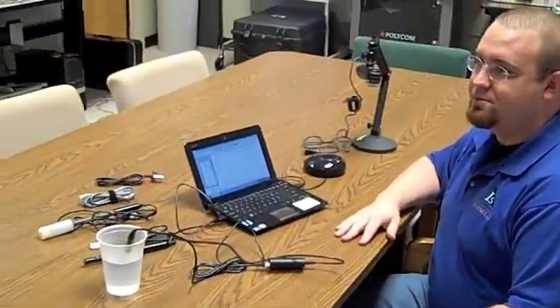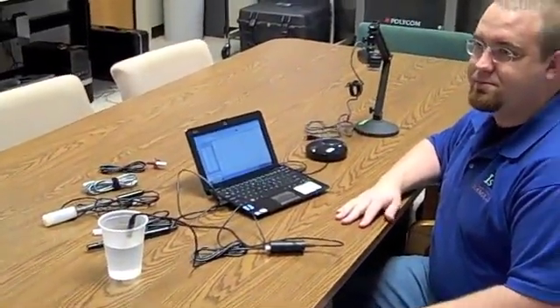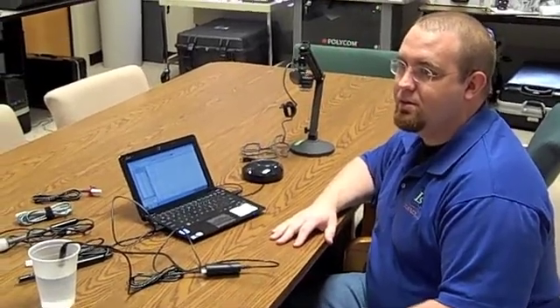Wow, that's pretty cool. So, right, all these pieces of technology I'd normally find in the classroom, Independent Science has allowed for someone with a visual impairment using a screen reader to really be able to utilize that. And we're able to utilize these pieces of equipment with the Logger Pro software in the classroom, correct? Exactly. We're making it accessible the same way that all the other students have it.